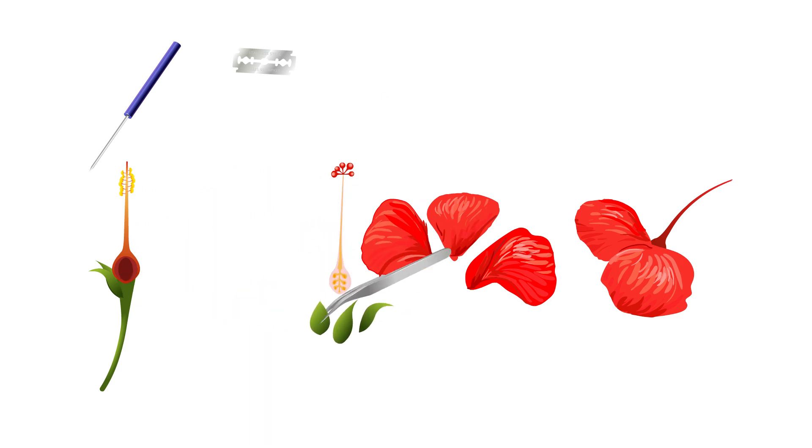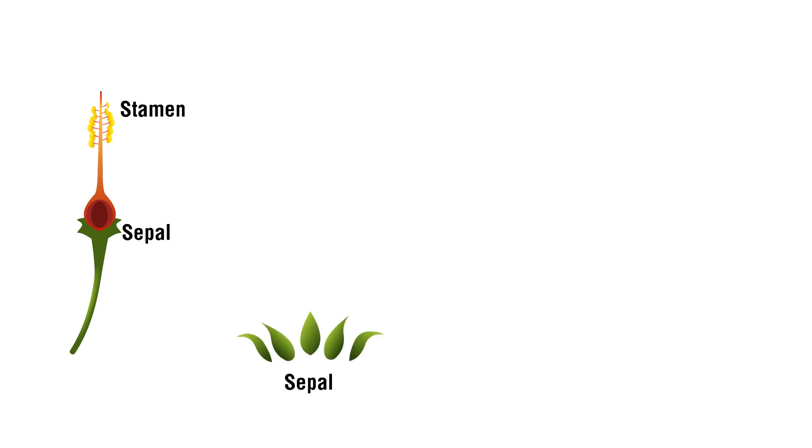Pull out the individual parts with the help of forceps and needle one after another. Observe and label each part of the flower carefully.